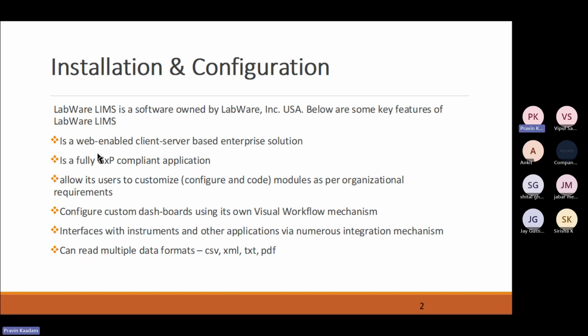And what are these requirements? The most basic is you can trace and track each and every activity being done in the application, being processed in the background.